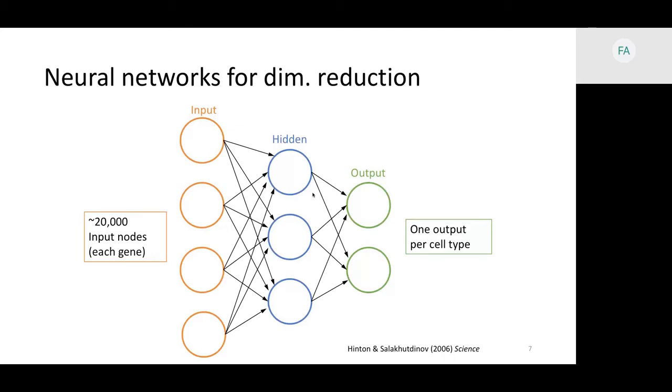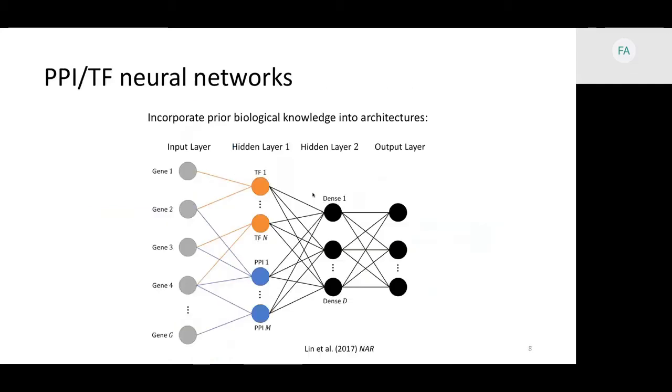So you'd like to constrain that. And one way that you can go about doing that is by incorporating some prior biological knowledge. And Gia in our lab had a paper in NAR on how she did this by using PPI or protein-DNA interaction data. And you can see that those nodes, that basically these modules of genes are much more sparsely connected than the fully connected versions, reducing the parameters. And we have extended this by maybe using the gene ontology, which will give you additional hierarchical information to do this, so we also explore that in this.